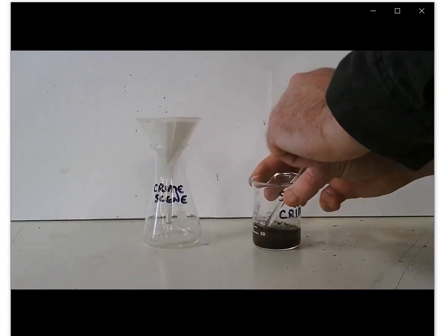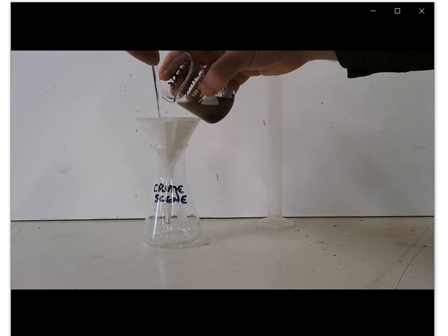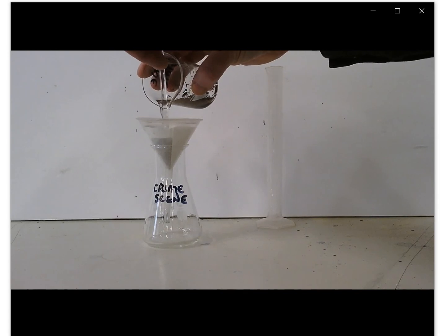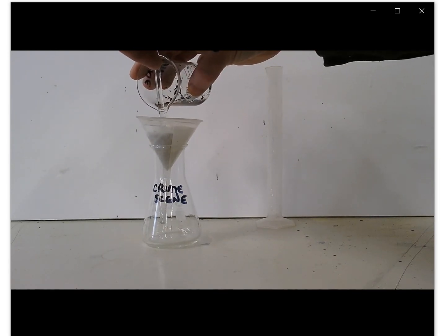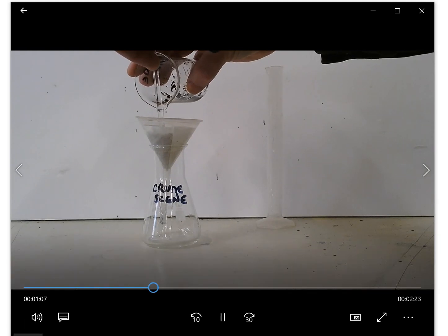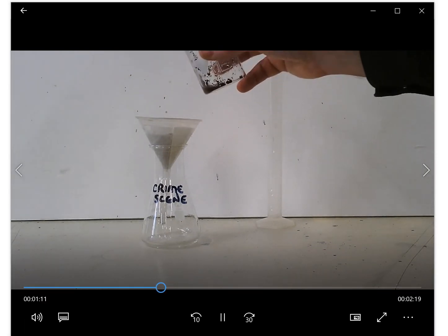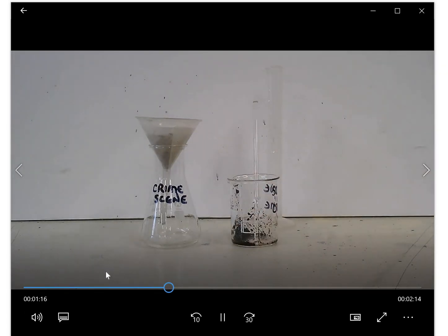And we always take care not to let the top of the liquid in the filter go above the filter paper, because then some soil might pass through. So the filter paper is going to stop the soil coming through into the bottom of the conical flask. So as you can see, we're getting a colourless liquid coming out the bottom of the filter.